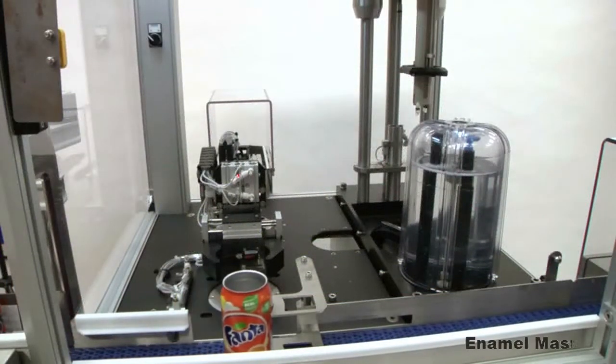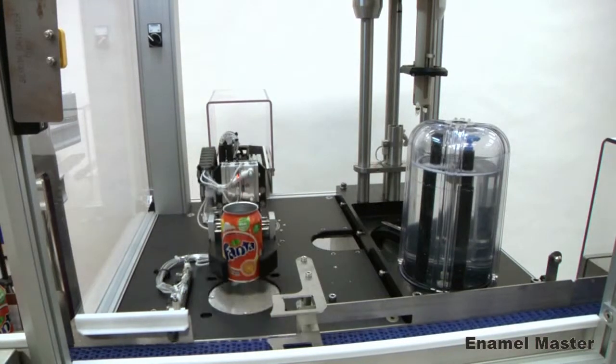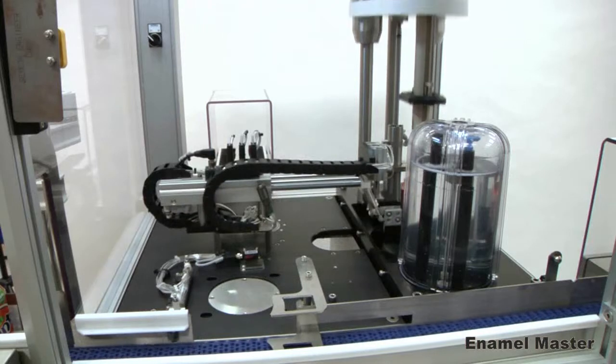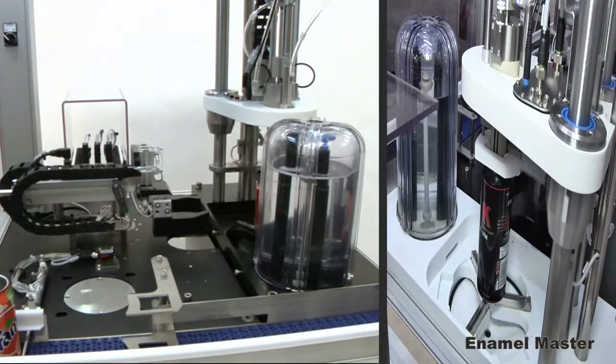Sencon's Enamel Master tests the integrity of beverage can internal coatings. Automatic measurement eliminates the risk of operator influence on the results and offers the potential for labour reductions.